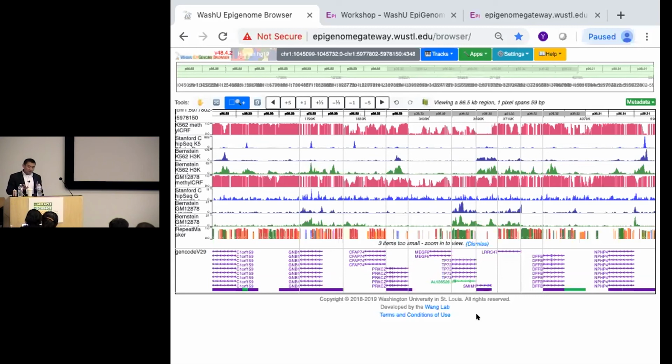Now you're going to need this almost immediately. You think, okay, what if I align all my transposable elements together, not side by side, but stacked together, and see what the signal looks like? You can do that by using this gene plot.